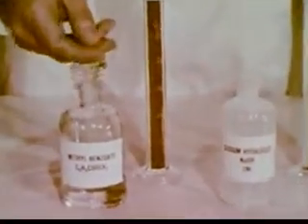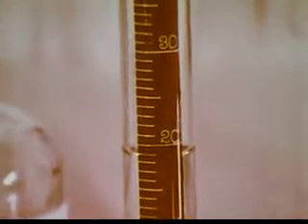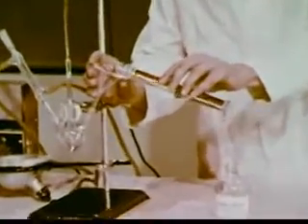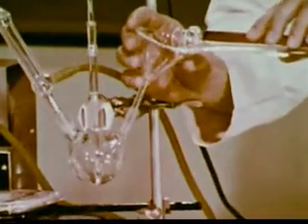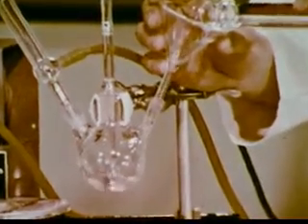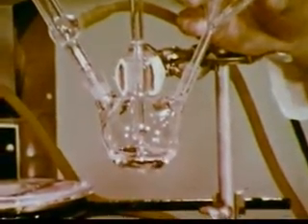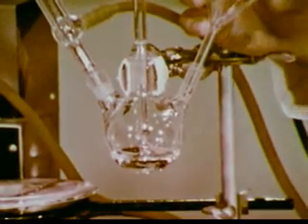Well, first we need to know the starting materials. Methylbenzoate is one, the methyl ester of benzoic acid. Let's measure out some of the ester. We then add it to the flask in which we will carry out the reaction. One reactant is then methylbenzoate.